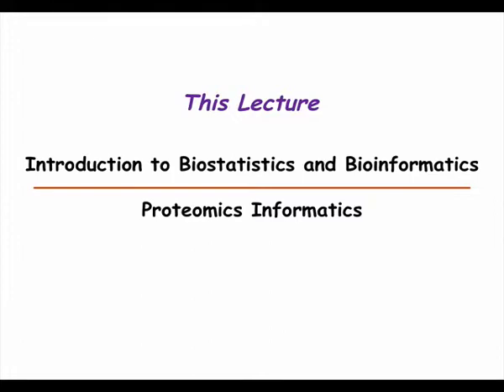So proteomics, and when I talk about proteomics, it's mainly mass spectrometry-based proteomics. There are also protein arrays that some people work with, but those will be covered by Stuart in the next lecture, and that's because those are very similar to gene expression arrays.